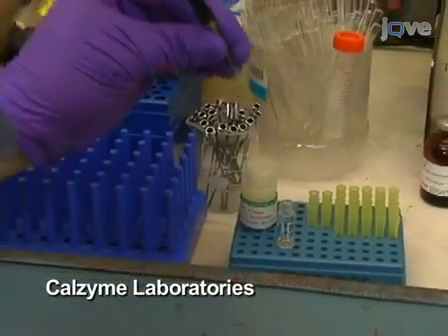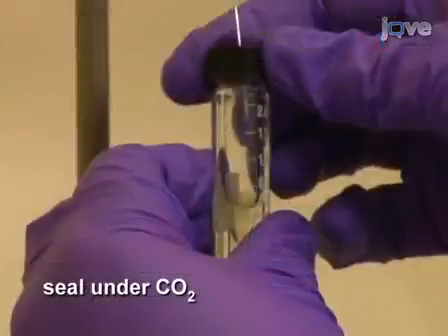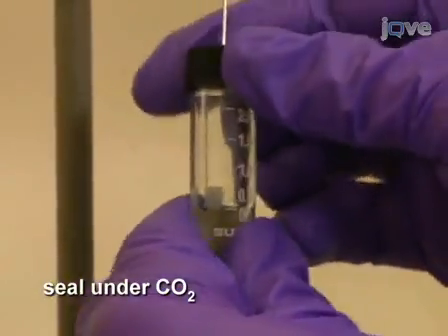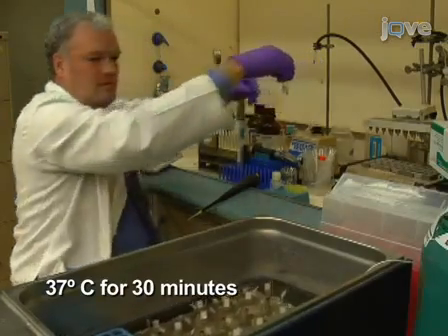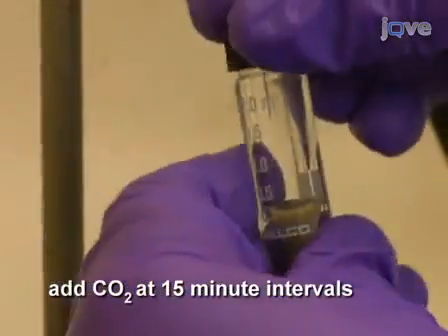Then add 20 microliters of a 7.5 units per microliter solution of urease. Flush the sample and seal under carbon dioxide through an inert septum. Hold the sample at 37 degrees Celsius for 30 minutes, while adding more carbon dioxide gas at 15-minute intervals to maintain the pressure.